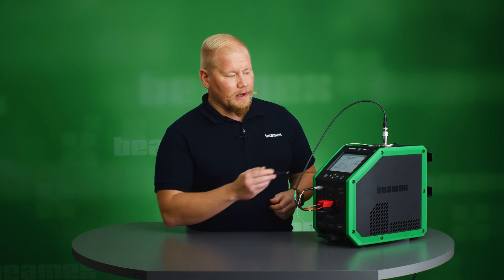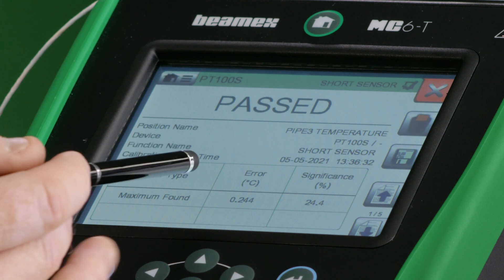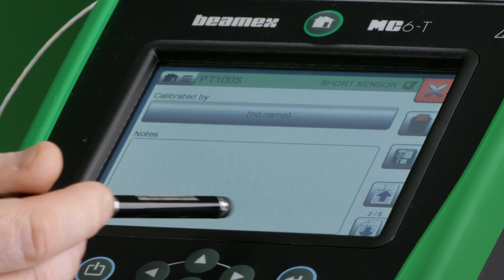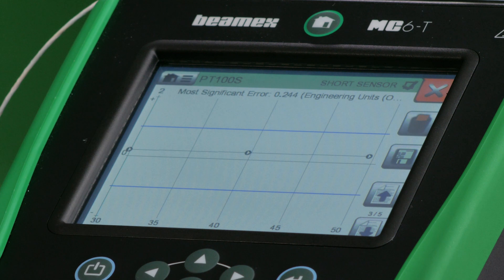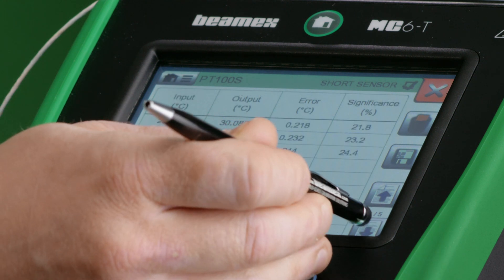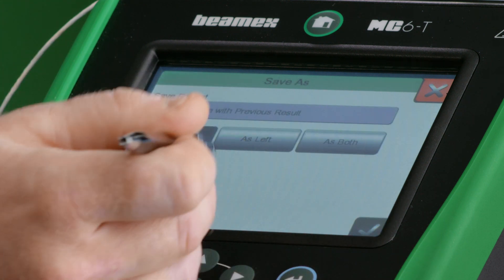We have now reached the last set point for this calibration. I can see a passed result and also see the error significance. I can put a note here, view my results in a graphical view and in numerical view, and if I like, I can also add some environmental information.